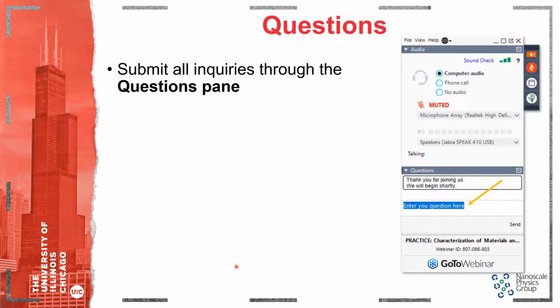Okay, great. That's all the questions that had come in for now. One question I had out of my own interest is, what are the prospects of doing some of these magnesium cathode growth or beam irradiation experiments in combination with liquid cell environments? Is it possible to do the graphene liquid cell experiments in a more electrolyte-type environment for those materials? I think it's definitely possible or feasible.